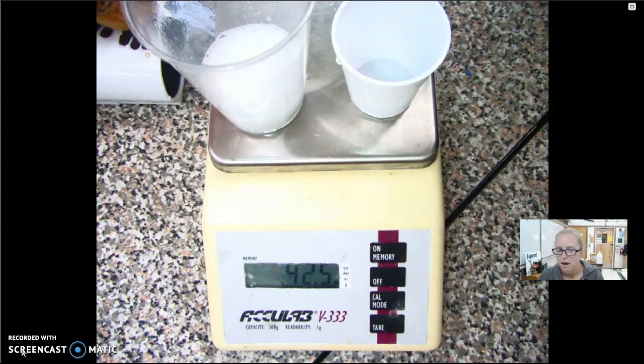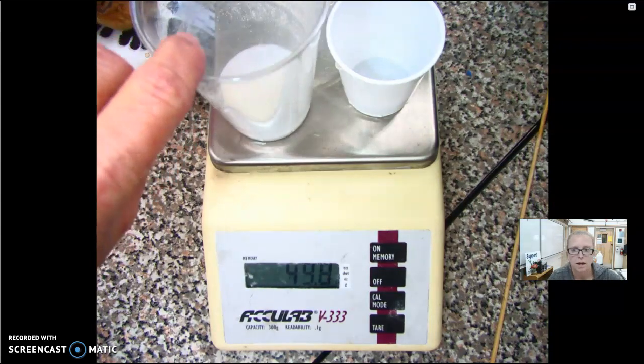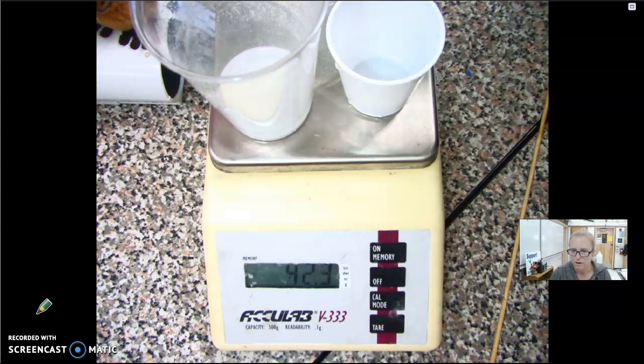And I'm going to time lapse this for you. We're just going to wait about a minute and see how much the mass changes. So here we go. I'll be back in a second. Okay, so it's been over a minute of time that has passed, and you can see that the foaming has subsided, and our mass now, our ending mass, would be 42.3. So our initial mass is 42.9 and our final mass is 42.3.